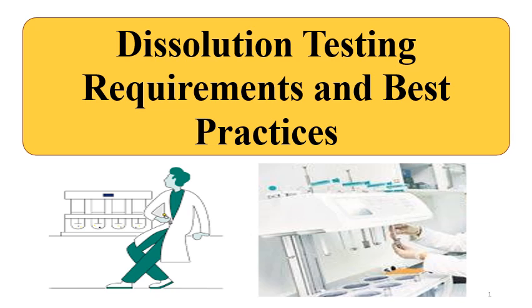Hello and welcome, dear viewers, to another topic on dissolution testing requirements and best practices. In this video we will see what the essential requirements of dissolution testing method development are, what the regulatory requirements are, and what the best practices are to have a robust dissolution method and to avoid regulatory queries.